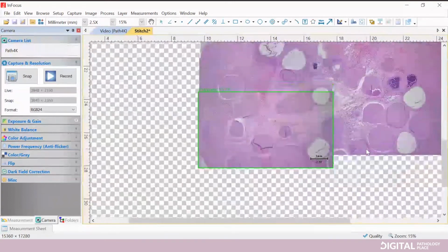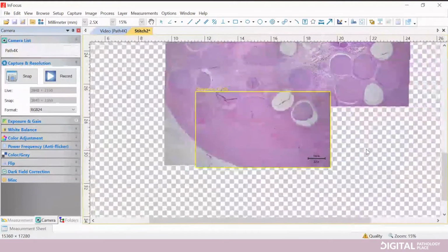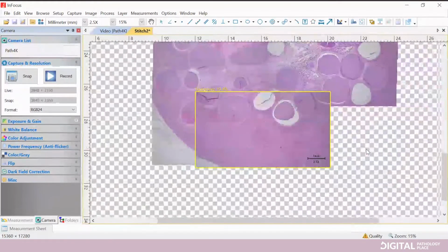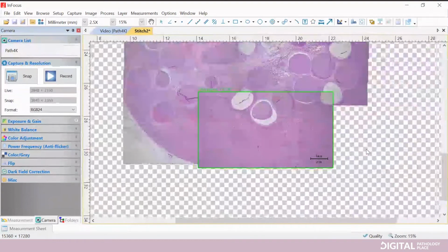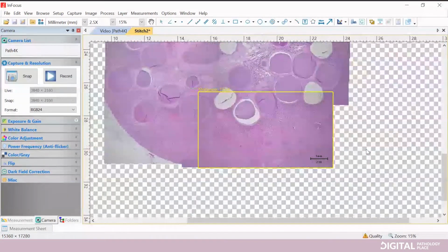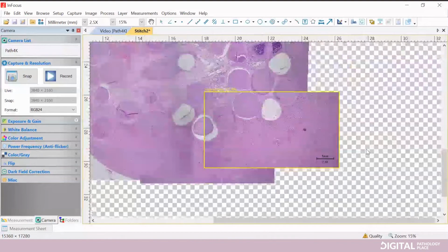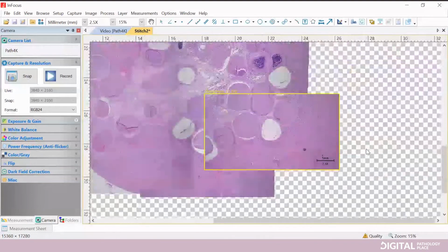That is so cool, because often for presentations, for teaching, you want to have the whole low mag of the slide. Right. Oh no, it was yellow. Yeah, yellow is still fine. If it gets to red, that means that you definitely want to stop. Okay. There you go. So that's good enough for now.